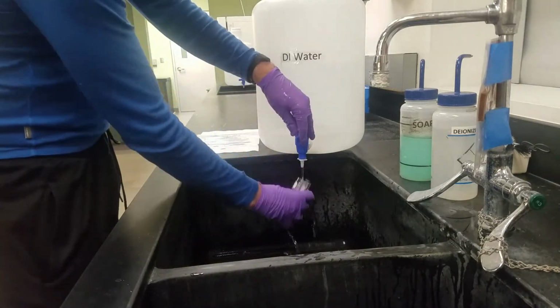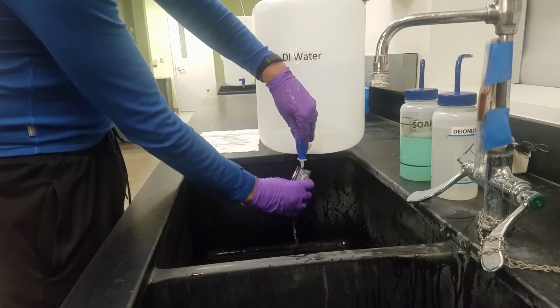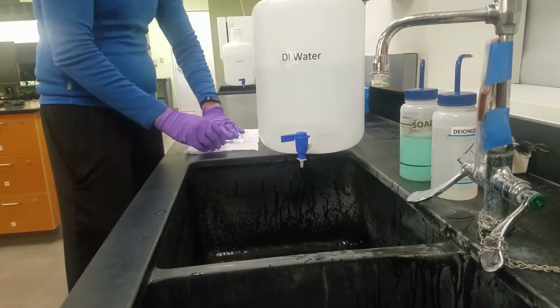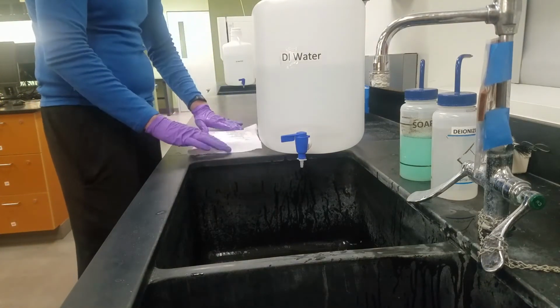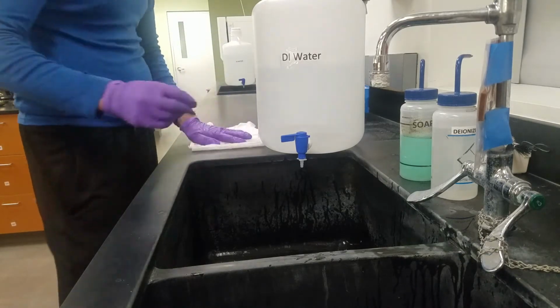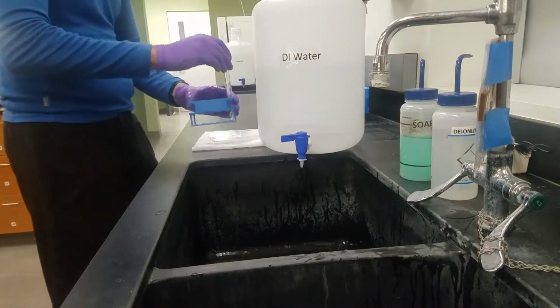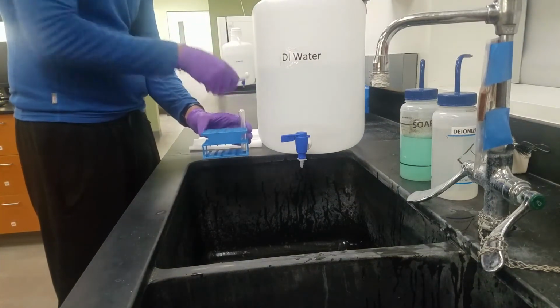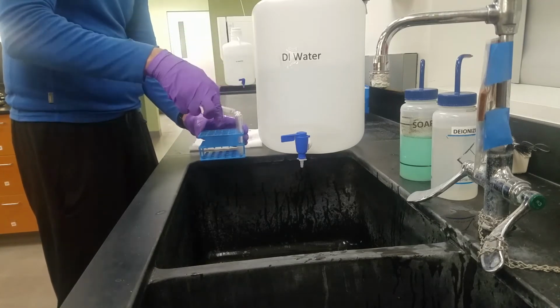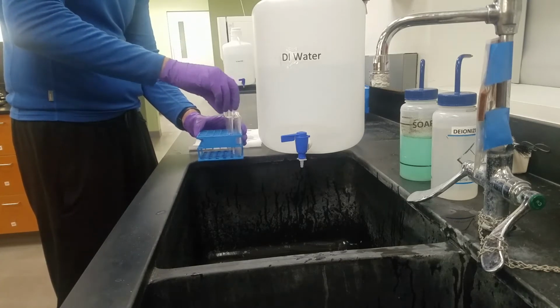Depending on if we need to use them immediately, you may decide to actually dry them physically with a paper towel. If it's the end of the day, don't spend your time drying with a paper towel. One of the advantages of living in the desert is it will dry by the next class period. So use that to your advantage. It does help to put everything away. Note that we're putting it open end down so the water can drain out better. If we do it the other direction, what will end up happening is the water stays trapped inside the container and it doesn't dry out very quickly.